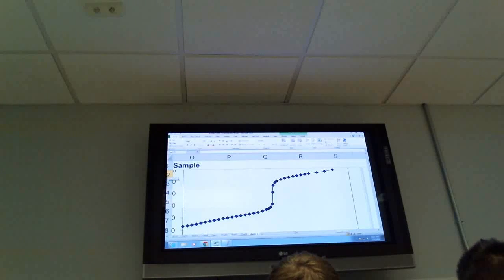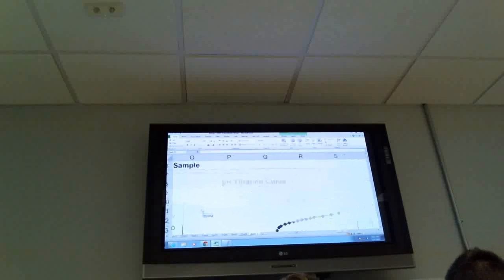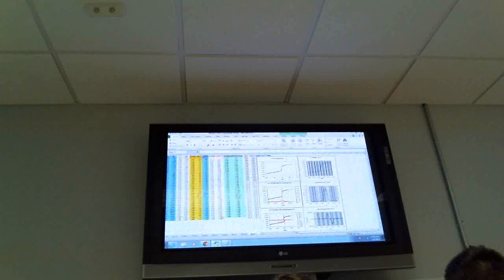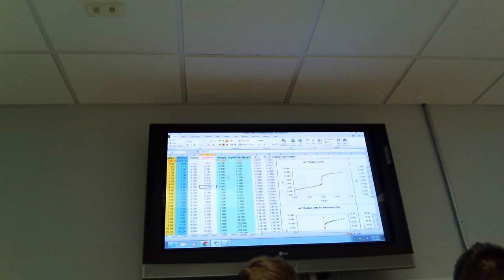Oh, and is there more data beyond 22 milliliters? No, I mean, that doesn't matter. I know if you extend it, but it would be nice to see more data. It's supposed to go to 35. I mean, that's what we calculate. Well, yours will be different, right? Actually beyond 35. Is there another equivalence point beyond there? What is the pH? pH is like 11.